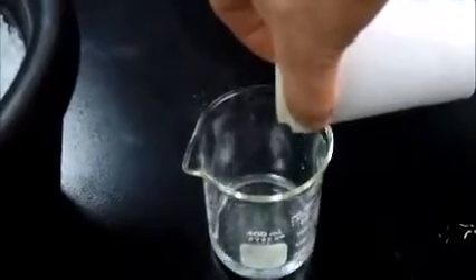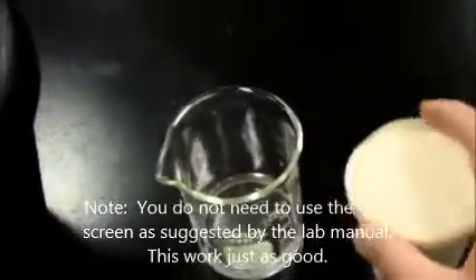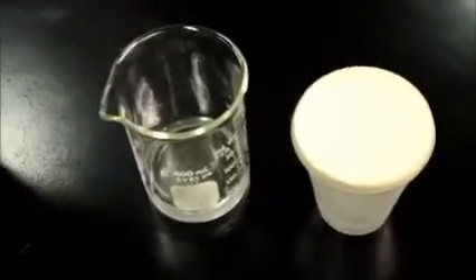Get as much liquid as you can. Nothing but solid there and liquid in there, and you can make your measurements. That is decanting.